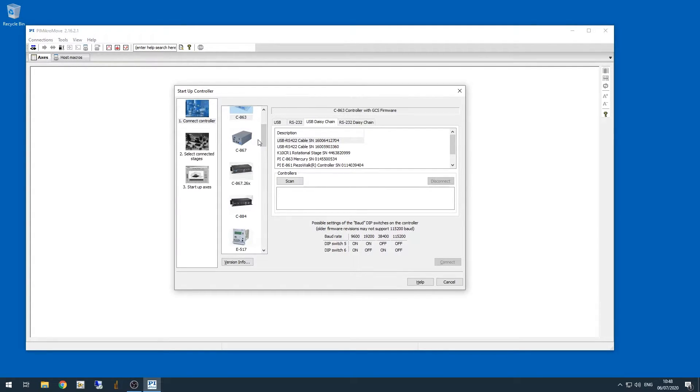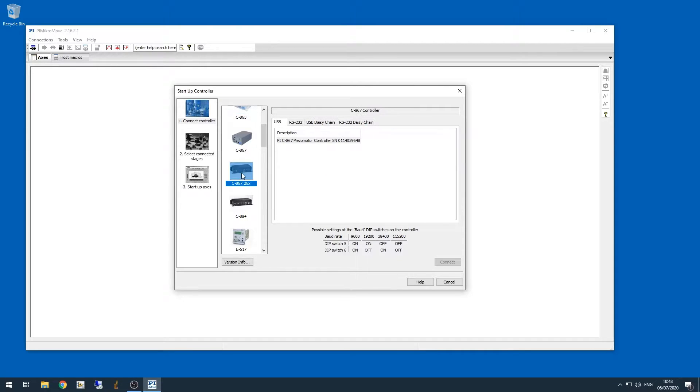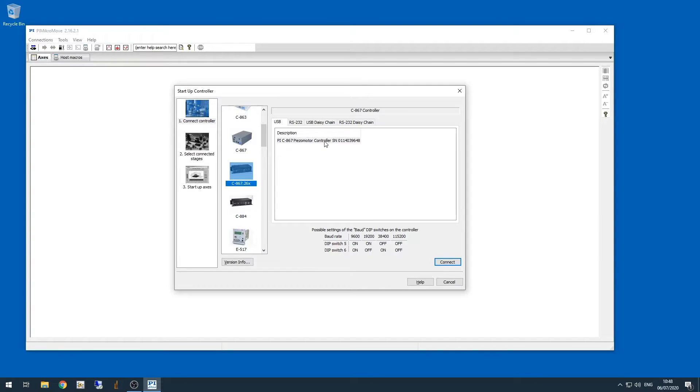Let's start with the sample XY stage controller, which should be the C867. So I'm clicking on that controller in the list of controllers, and you can see that because the driver is installed and the computer is recognizing the device, it shows up in the box on the right under the USB connection tab.